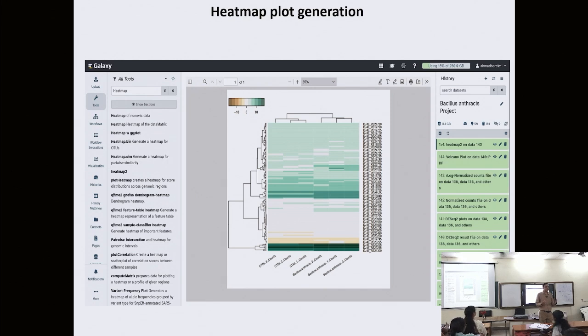And they may be there in one of these groups. So you would like to know what these groups are. You would want to perform functional and enrichment analysis of these groups to check which functions and which pathways are enriched, so that will help you in understanding not just which genes are differentially expressing, but which pathways are differentially expressing, right?